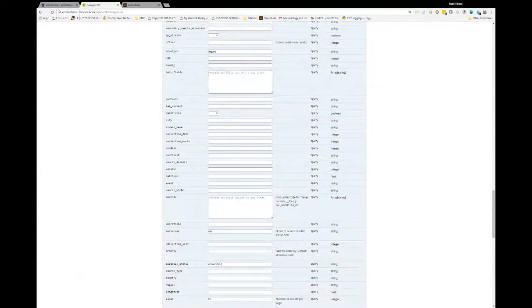So first we kind of play with this and we say, okay, fine, this is the data we want. And we just want to start anytime there's a new Agona, I just want to fetch it.